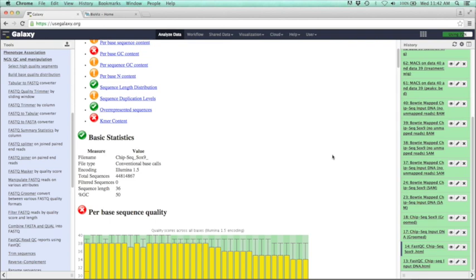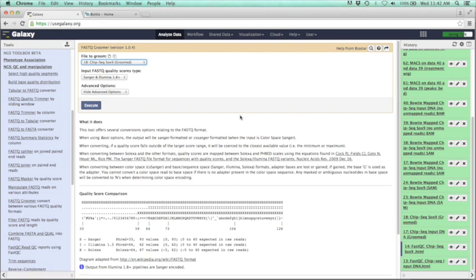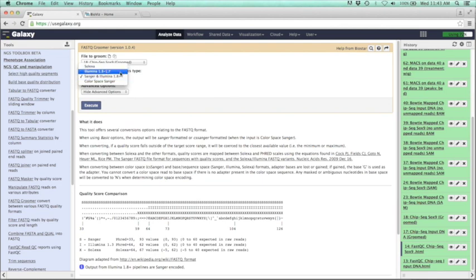For our next step, we're going to use that information to groom our raw data so that Galaxy can work with it properly. Go back to the toolbox, go to QC and manipulation, and look for the FastQ Groomer. Select your FASTQ file, and for the input FASTQ quality score type, change that to Illumina 1.3 to 1.7, since we know our data is Illumina 1.5. Go ahead and execute it — you'll want to do that for both files. This generates a nearly identical data set to the original FASTQ file, but now the quality scores are set so that Galaxy can work with them.